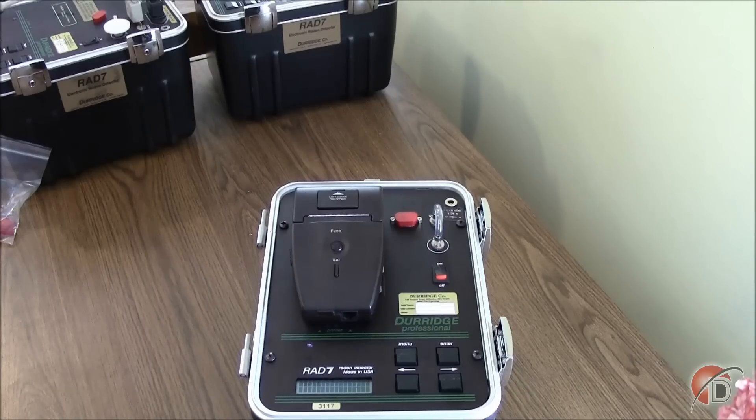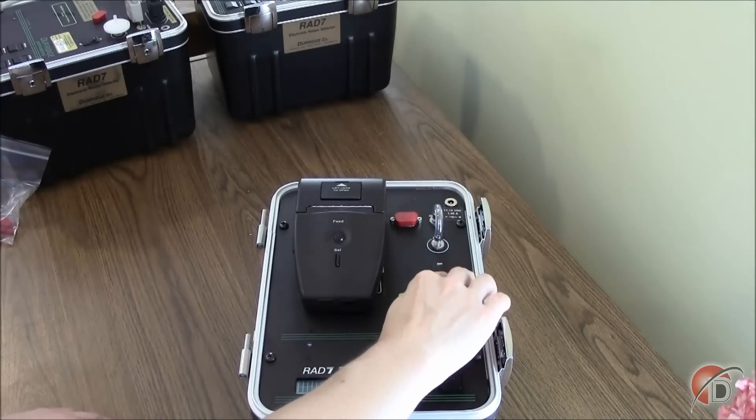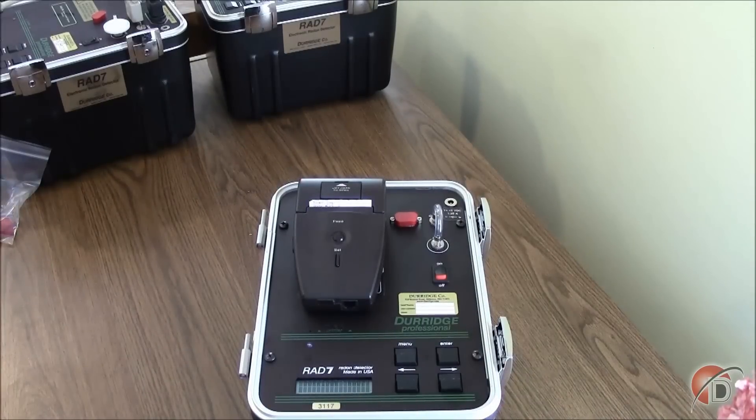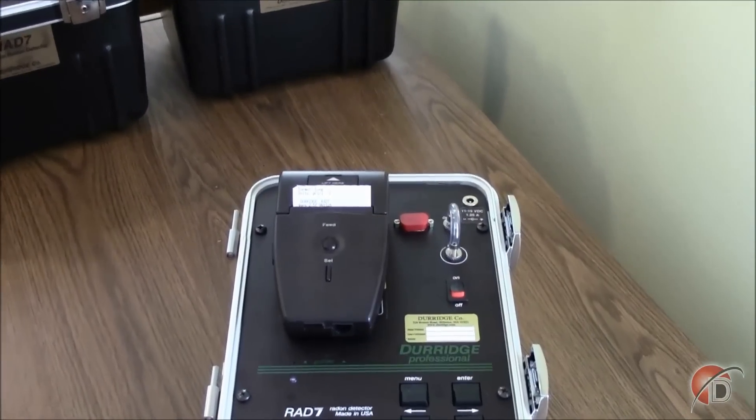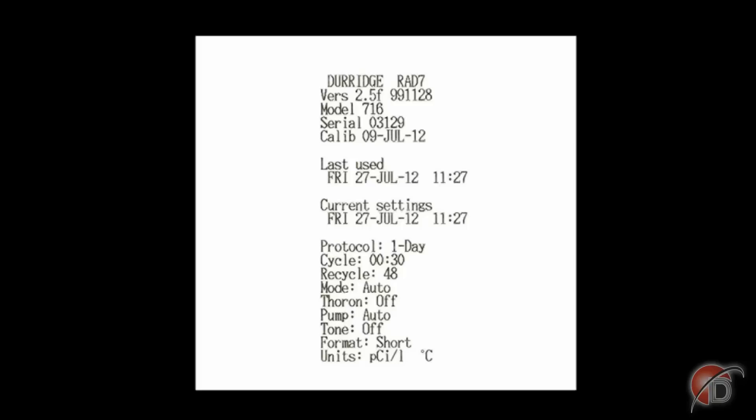Now the RAD7 is ready to record. Turn the printer on using the sliding button on the side — the light under the feed button will glow green. Turn the RAD7 off and back on; the settings will now be included on the top of the printed record. Prior to officially beginning our measurement or leaving our RAD7 unattended, we can review the header of our printed record to verify that the program is correct. The header first shows basic information about the RAD7, including the serial number and its last factory calibration. The date the RAD7 was last used is shown next, followed by the current date. Lastly, the current settings for our one-day protocol are printed at the bottom of the record.